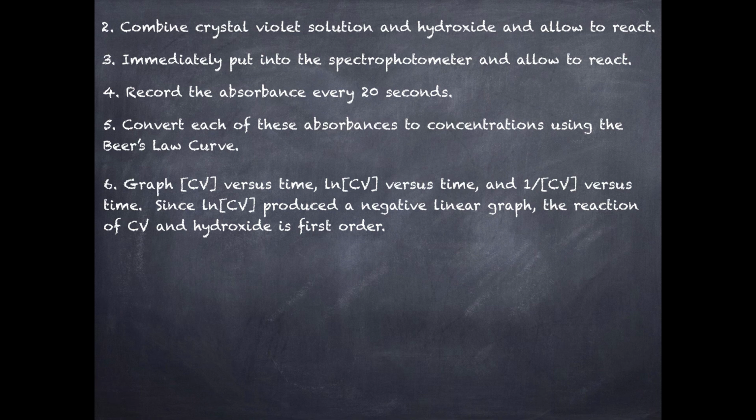A couple of other things, remember one of the most important things for this lab was making sure that you didn't get fingerprints onto the cuvette. So if you get fingerprints onto the cuvette, remember that the absorbances you would measure would be higher than they should be because the grease from your fingers will absorb some of the light.